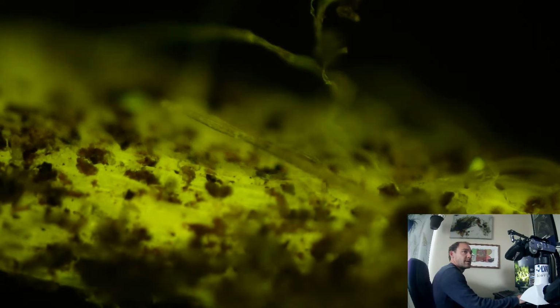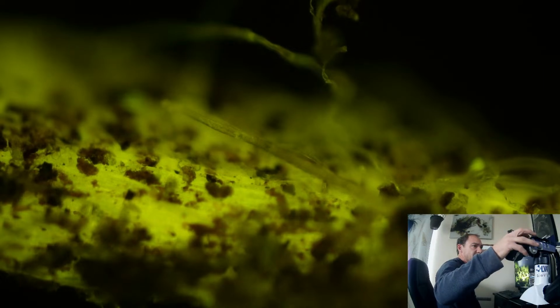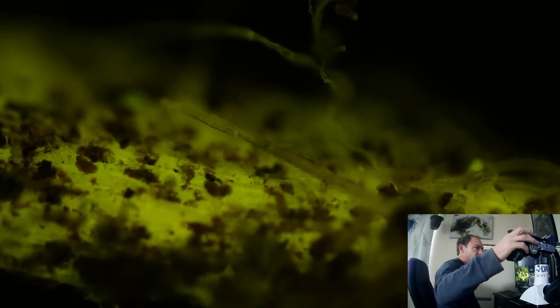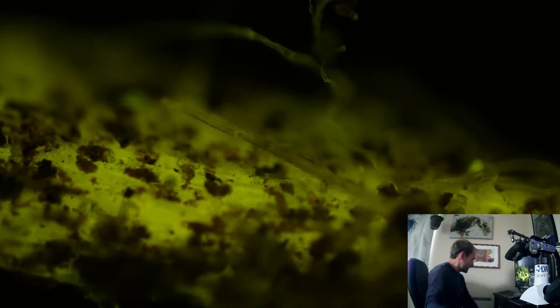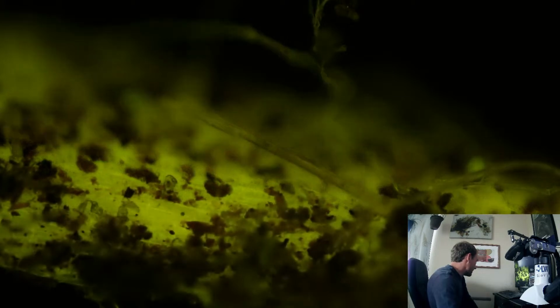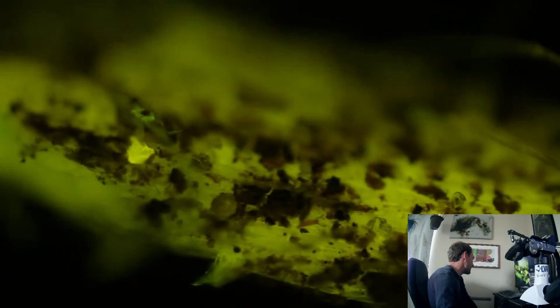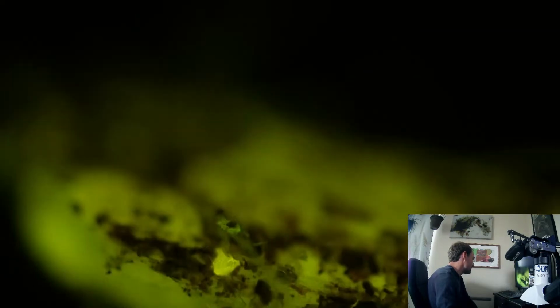Yeah, and actually if I make some adjustments here and go lower ISO, might get a little less glow overlapping, a little sharper image. Yeah, I like that a little bit better. A little less noise, since this is glowing so bright.